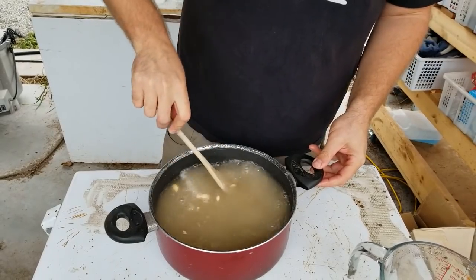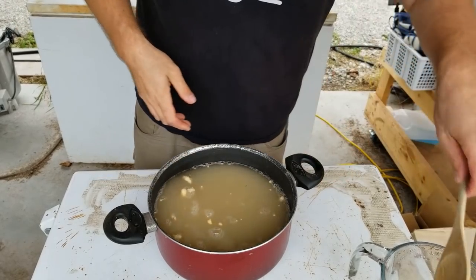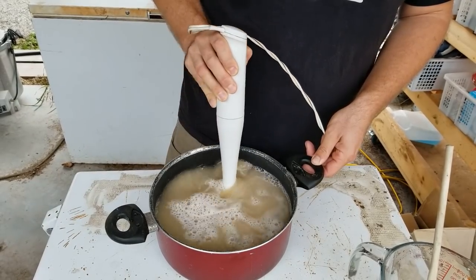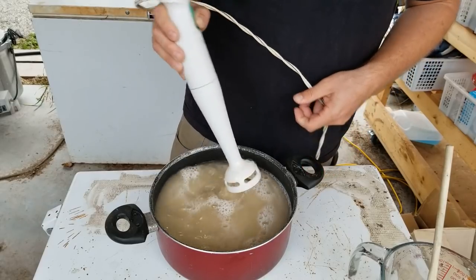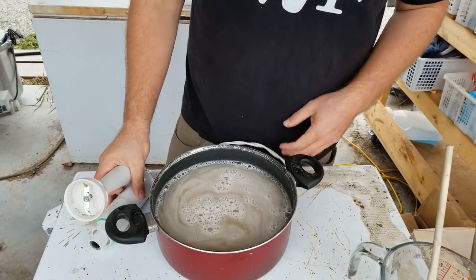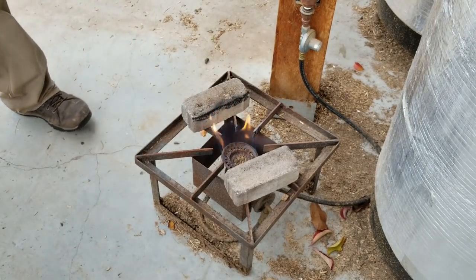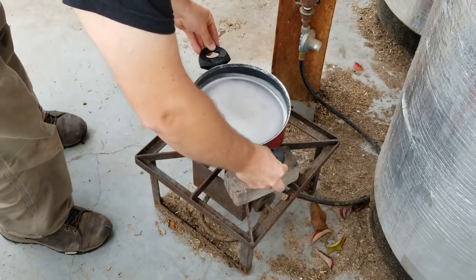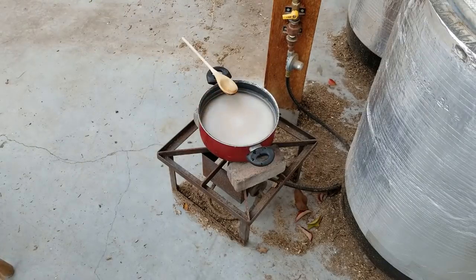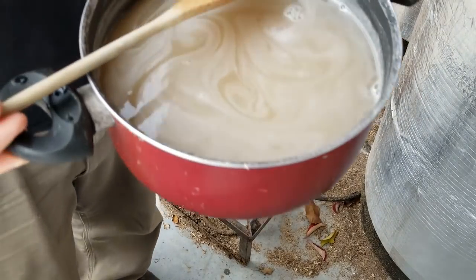I'm going to stir it with a spoon and mix it in, but this doesn't do as good a job as you'd like. So I'm going to take an immersion blender and blend the solution to get all the agar and sugars mixed thoroughly and have a really nice smooth mix to pour my plates. I actually preheat my agar in a pot and keep stirring it so the sugars get absorbed into the water and we don't have any clumps when pouring our plates. We constantly stir it and watch that it doesn't actually boil — we're just trying to bring it up to temperature.